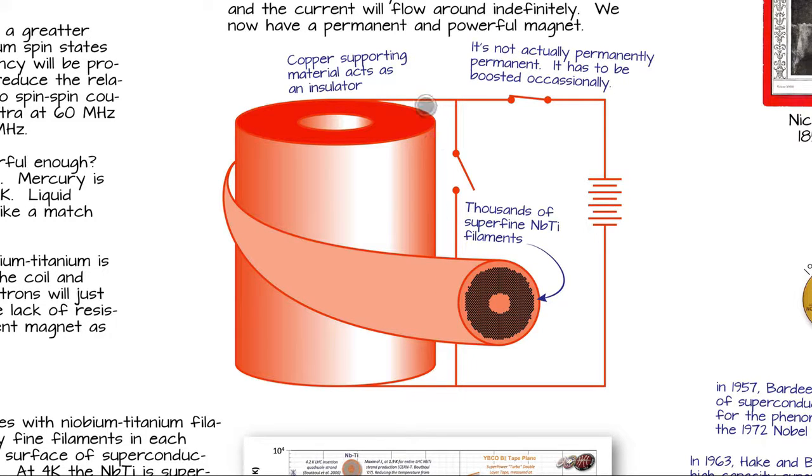Because the way you charge up these magnets is you hook it up to a power source, you start loading it up with current, and getting that current zipping around here. There's zero resistance, so just keep loading it in. Load in as much as you want. There is a limit, of course. And once you've gotten the magnet as full of current as it can handle, you open up this circuit and cut off the power, and you short circuit the magnet.